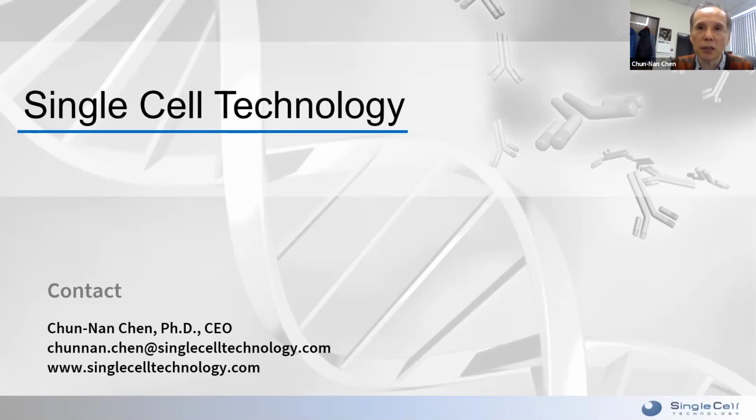But as far as I know, the microarray scanner is one of the most sensitive instruments available. It's basically a confocal microscope with a very little distance between the lens and the surface that emits the photons. So I think it's one of the most sensitive devices here. So I don't think there's any sacrifice being made here. It's strictly the limitation of our system or the instrument used for detection. Right. I don't know if I adequately answered that question, but that's my answer. Kind of a tough question. Sensitivity versus specificity is always tricky, right?